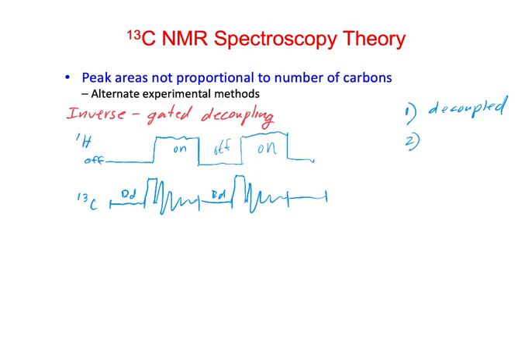Right, so in general, we would have no NOE, because usually we generate the NOE by having the decoupler on, or irradiating those protons, during the relaxation delay. So essentially we have no NOE. Is it completely no, or just a reduced effect?